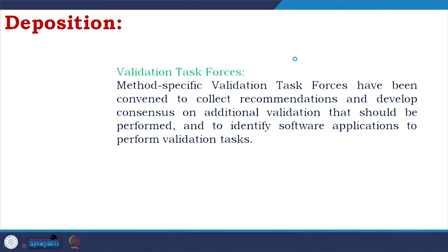Validation task forces: method specific validation task forces have been convened to collect recommendations and develop consensus on additional validation that should be performed, and to identify software applications to perform validation tasks. I do not want to go into detail, but this is an area which is very critical. When the first crystal structure, myoglobin, was solved, people never imagined that thousands of structures would have to be deposited, but now that is the case. So, there are validation task forces before you put it into the final format.